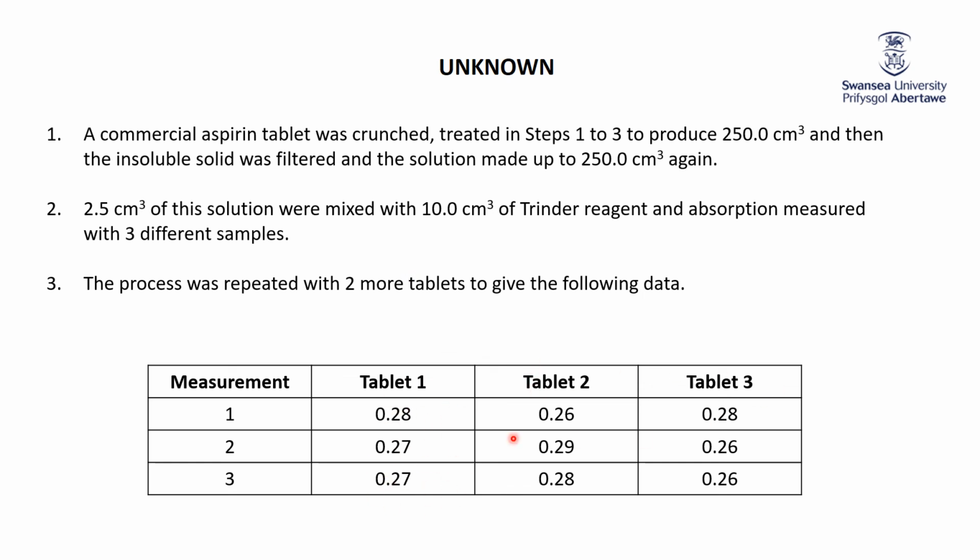So there we are, first tablet, second tablet, third tablet. There's the absorption for each one measured out 3 times. Obviously there shouldn't be any difference, and you can see they're pretty close to each other. And now we can use these data to finish off.